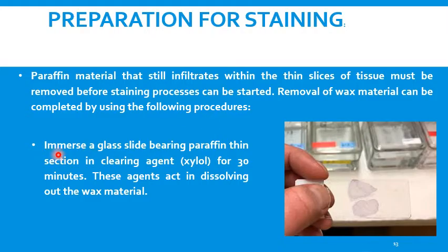First, immerse the glass slide bearing the paraffin thin section in the clearing agent xylol for 30 minutes. This agent acts by dissolving out the wax material. The xylol dissolves the wax and leaves only the sample.